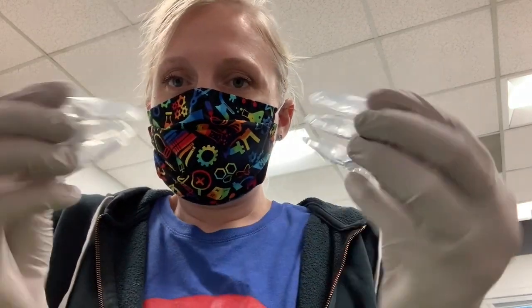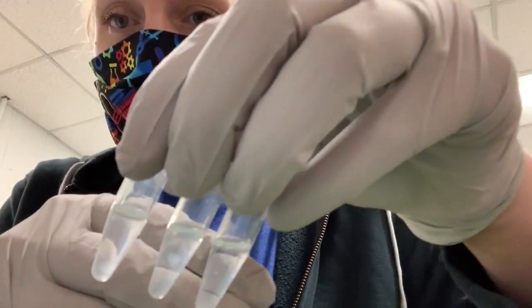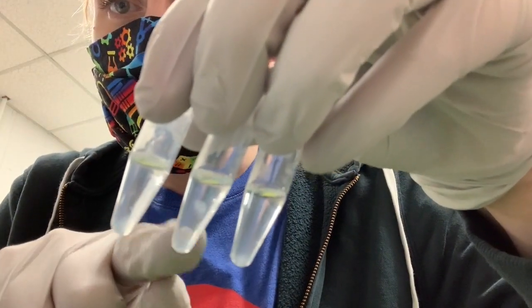Okay, I'm going to invert my tubes just twice or 3 times. You'll see that the pellets will become sort of dislodged. They might also change color a little bit and become a little bit more white and opaque. You can see that one there. And then I'm going to spin for 5 more minutes at maximum speed at 4 degrees Celsius, and then I'll get them out for the last step.